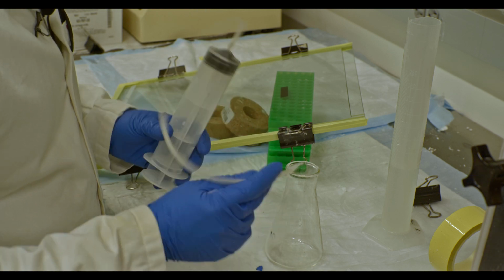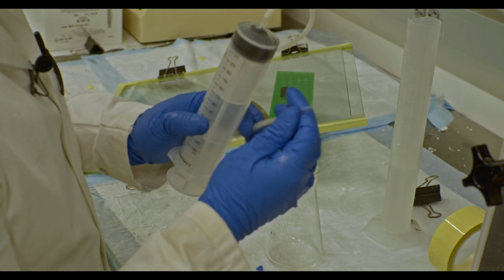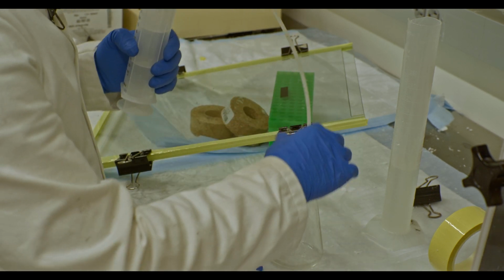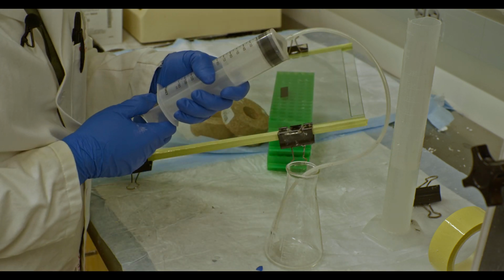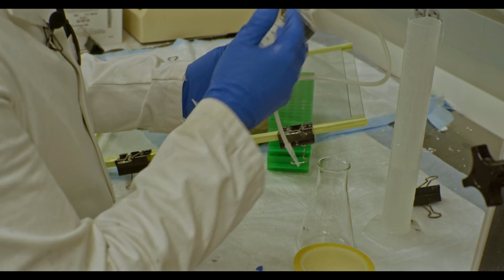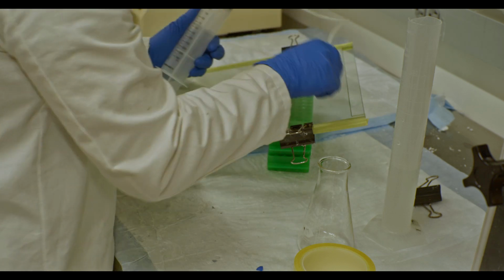Once you add that TEMED, you should have a syringe in hand. This syringe has a little bit of tubing and a pipette tip that has been cut off with a razor, so the inner diameter is actually quite a bit larger. The reason to do that is that it effectively helps you lay down the gel quicker. Whenever I have the gel solution here, I'll put the syringe in and pull back on it in order to take the solution out of the Erlenmeyer flask. I'll actually be putting the Erlenmeyer flask at an angle, probably inside this tape, and that's to help me get all of it in the syringe as fast as possible. I'll have to tap it to get some of the bubbles out, but as soon as it's nice and even in there and in the tubing, I'll have to just start laying it down on the gel plate.